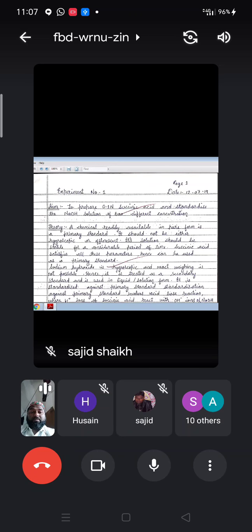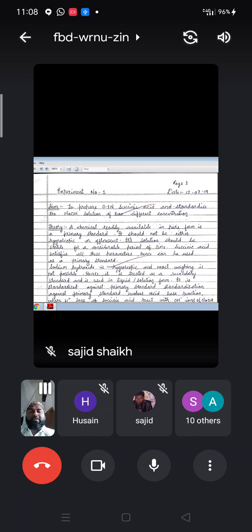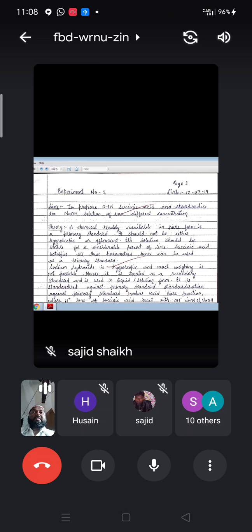Today we are going to see experiment number one: to prepare 0.1 normal succinic acid and standardize the NaOH solution at different concentrations. Why has succinic acid been chosen? Succinic acid is used as a primary standard.